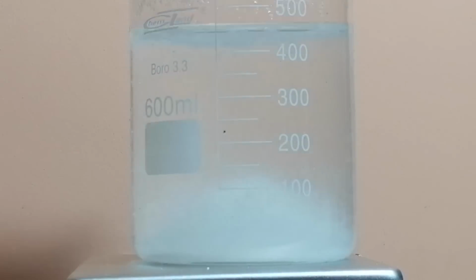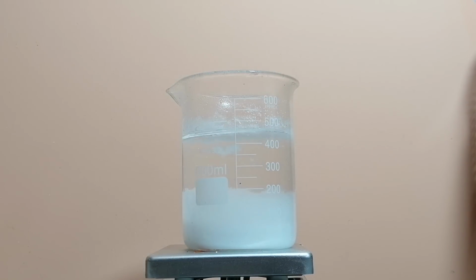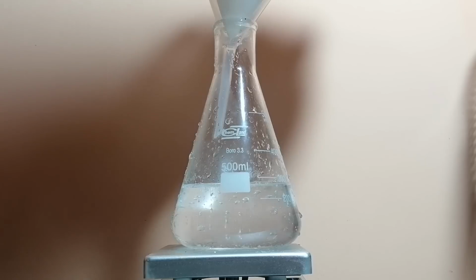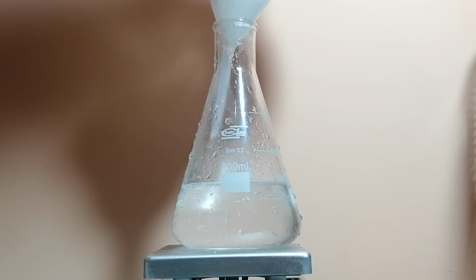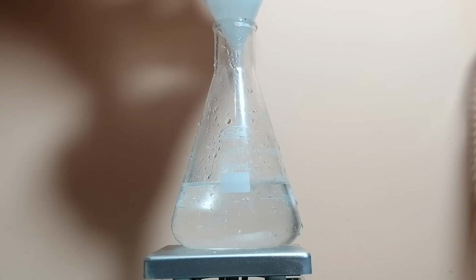Anyway, I've put it in the fridge for the night, and instead of sleeping I've played some Fortnite. After an intense gaming sesh, this is how the beaker looks now. You can see there's a bunch of crystals of boric acid. Anyway, the solution was filtered through a coffee filter. In the water there is some unreacted HCl and salt, and both are soluble in water.